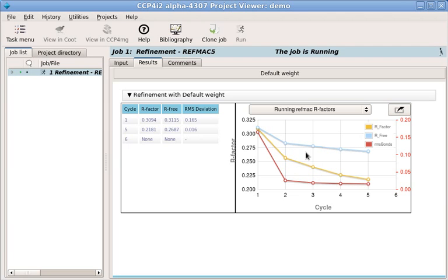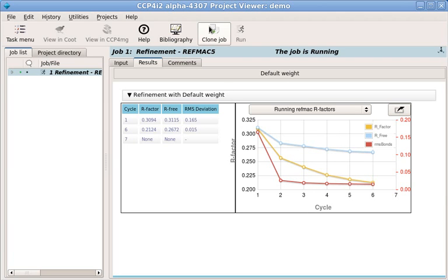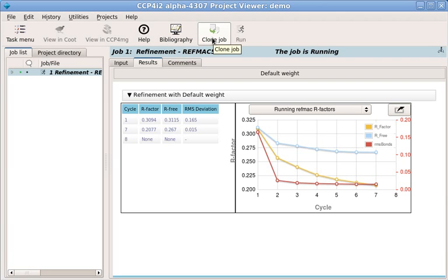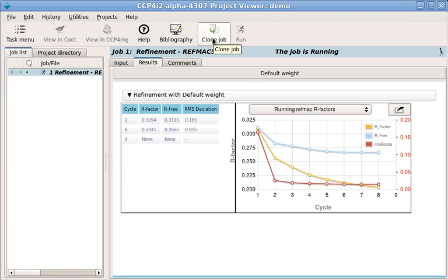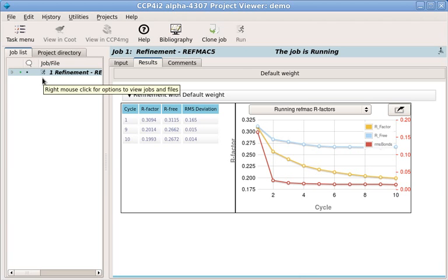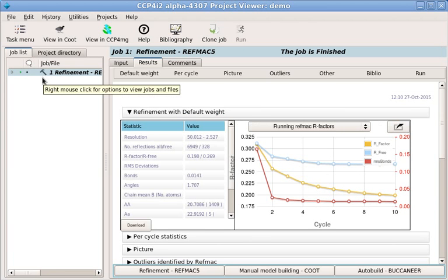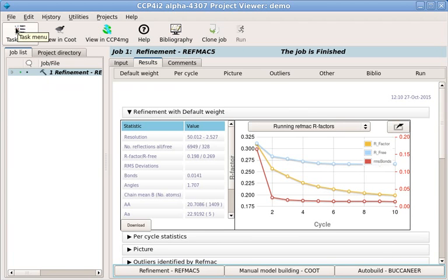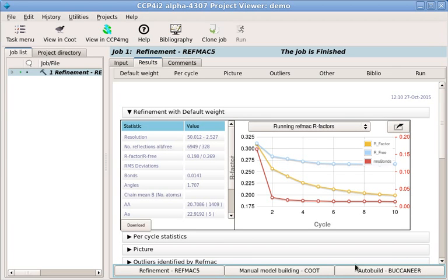If we want to run the job again with different options, we can use the Clone Job button. When the job is finished, the icon in the job list will change. We could now go back to the task menu to select our next job. But there are also some suggested jobs which we might want to do next at the bottom of the results. Let's do some manual model building in Coot.